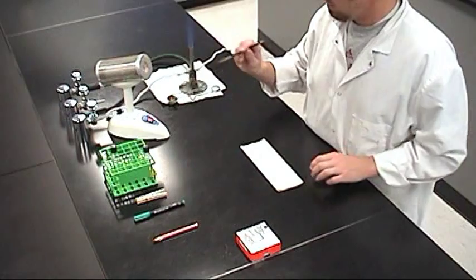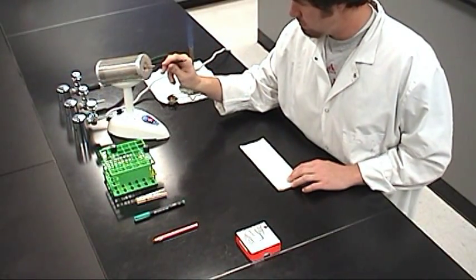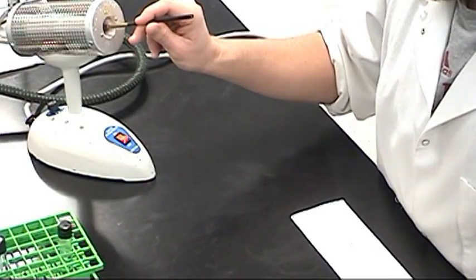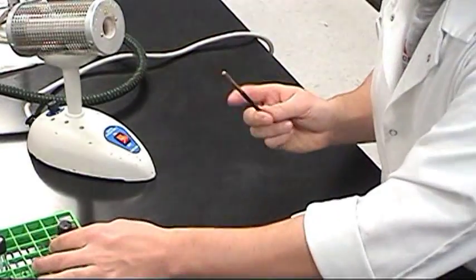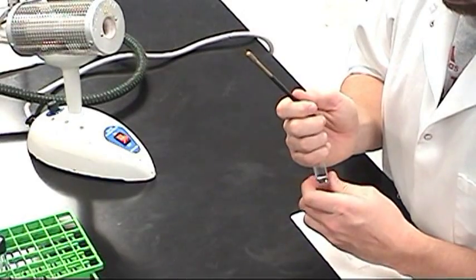To take a sample, flame the loop for at least five seconds to sterilize it. With one hand, hold the loop and grip the test tube cap with your little finger. Use your other hand to unscrew the tube from its cap.